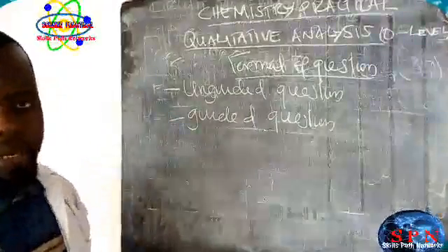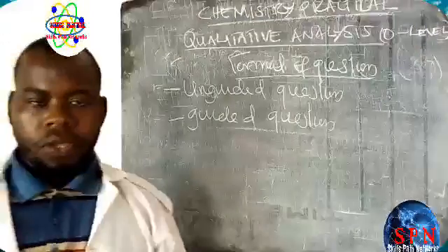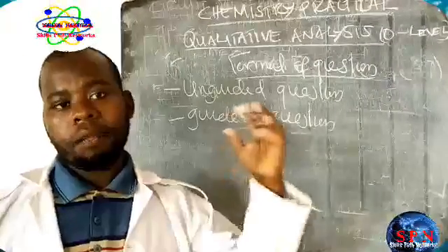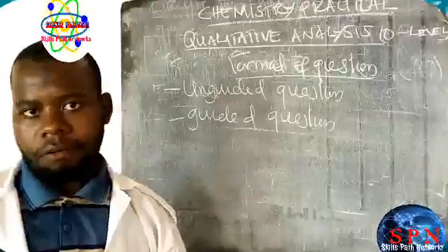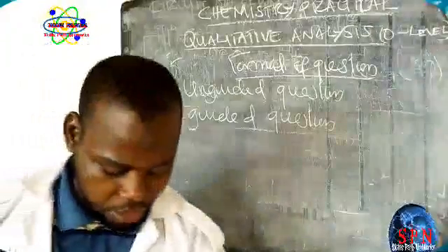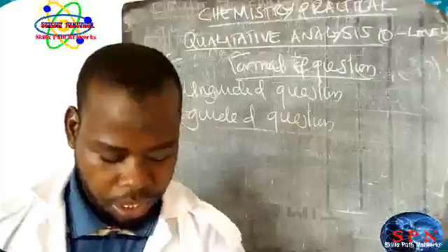When you say guided or unguided, it means you perform all the systematic procedure from the preliminary testing of the solution to the confirmatory test. And the format appears in this.